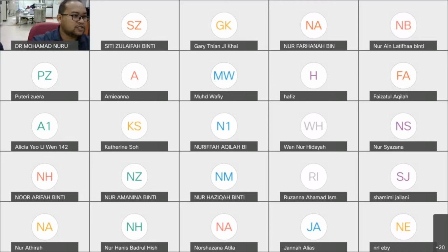Okay, so sample name, put as simple as you can. Normally for my students, for example, my name is Muhammad Nurul Azmi, I use MNA1, version number 1, MNA2, version number 2. Don't use compound reaction with blah blah blah. It's too long. It's not really nice.